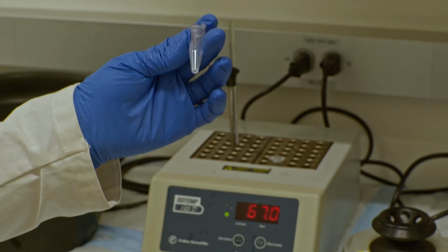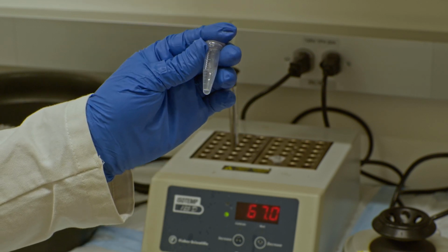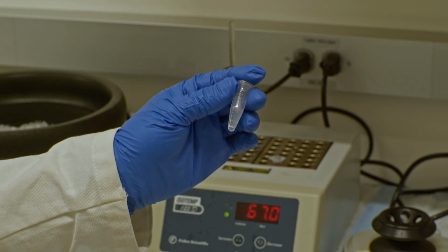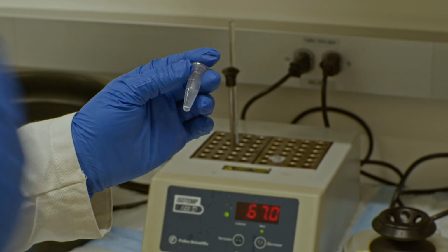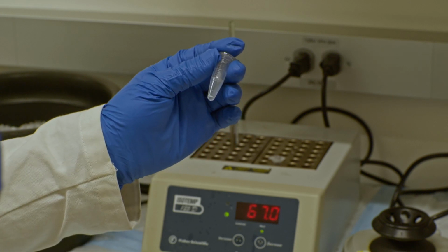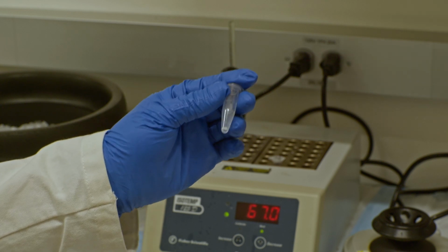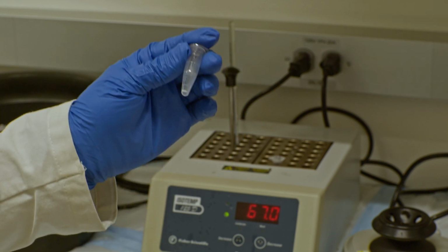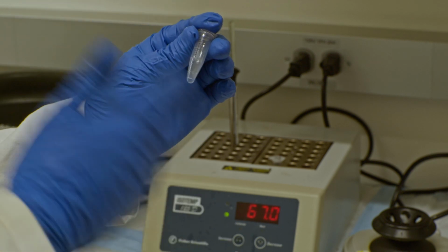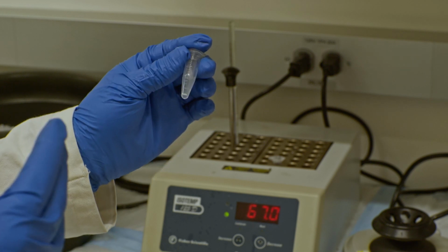Once you have radioactive material in hand, you can then put this primer on its own back into the freezer where the ATP is found. Again, label it really well as what the primer is, when it was made, in order for you not to mix it up with potentially older samples you could have in this fridge. Of course, we're not done yet. The next step is to anneal the primer onto the template strand. But for example, if you had something to do in between those times, you can put this away and store it in the freezer. It'll wait for you there until you come back.